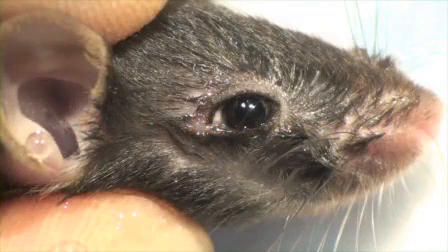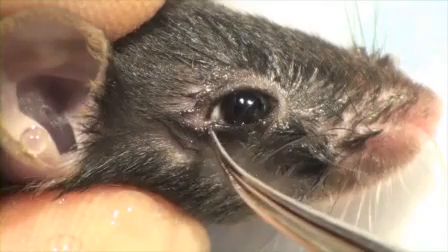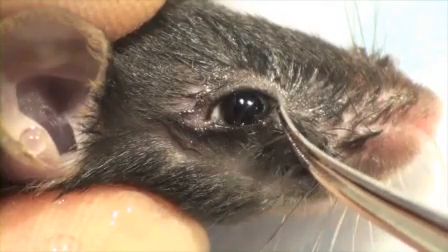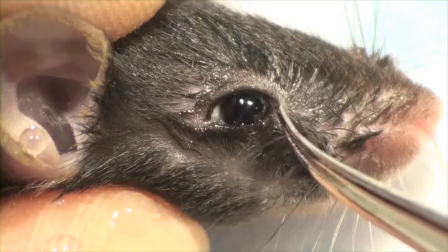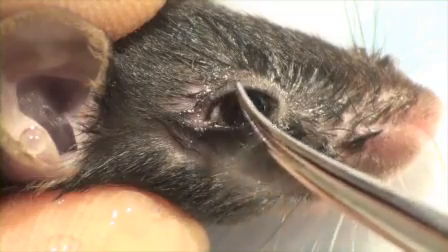This video will illustrate the mouse eye enucleation, or removing the eyeball from the eye socket. The eyeball is bounded by the lower lid margin. Here is the medial or nasal canthus. In the back is the temporal or lateral canthus. Above is the upper lid margin.